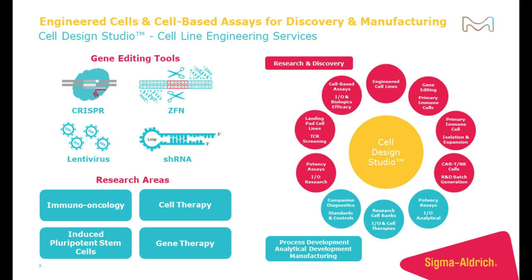So as I mentioned, we develop and use a wide variety of gene editing tools. These tools include, but are not limited to, CRISPR-based tools, things like nucleases, as well as CRISPR activation and interference, and CRISPR integration using homologous recombination or HDR-focused tools.